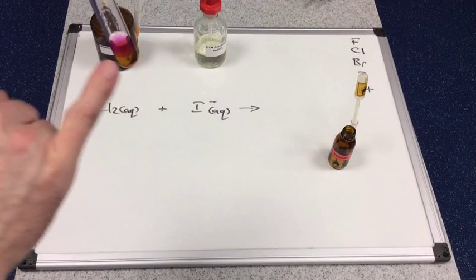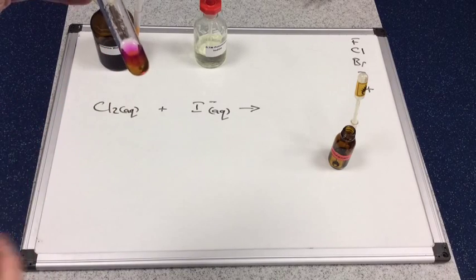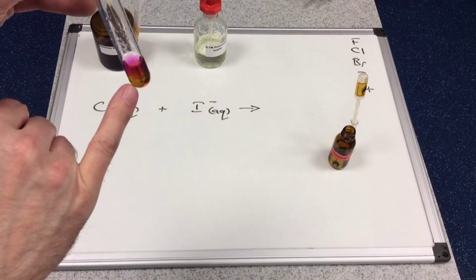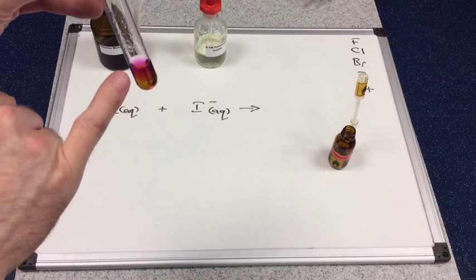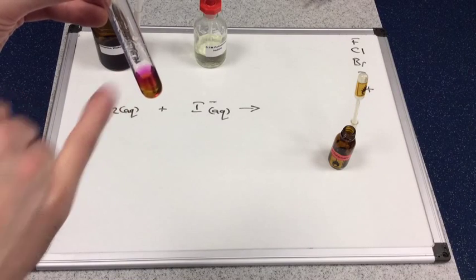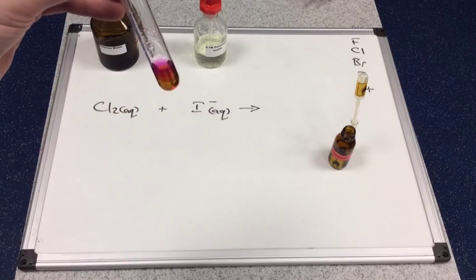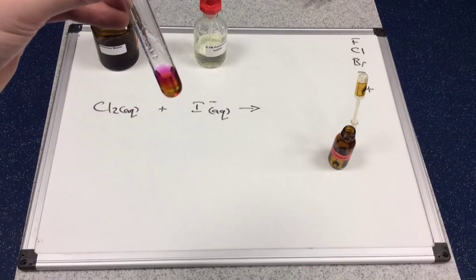So we've got iodine in this test tube. Iodine's purple. So when it's in aqueous conditions it's kind of a brown color, and it dissolves fully into the cyclohexane non-polar layer and we see its true purple color. So there's confirmation that we've got iodine in this test tube.